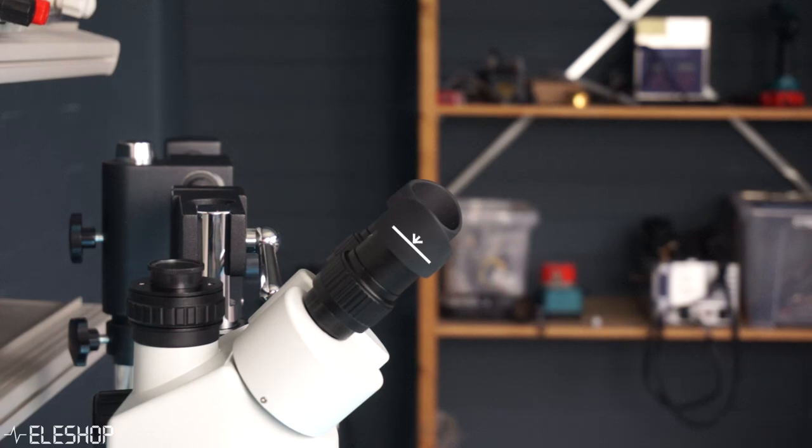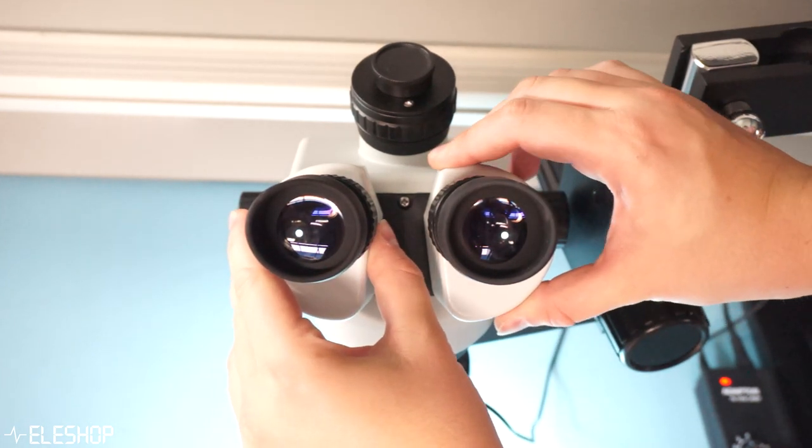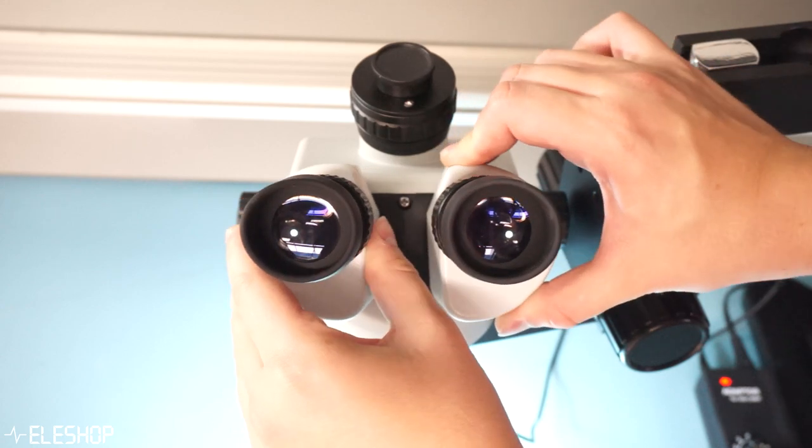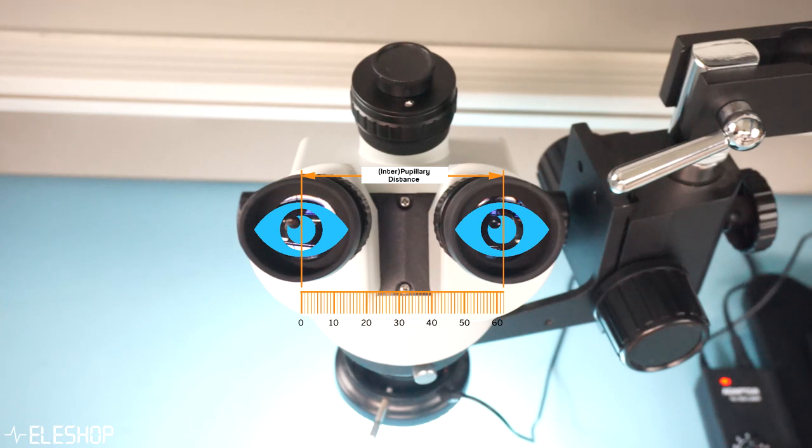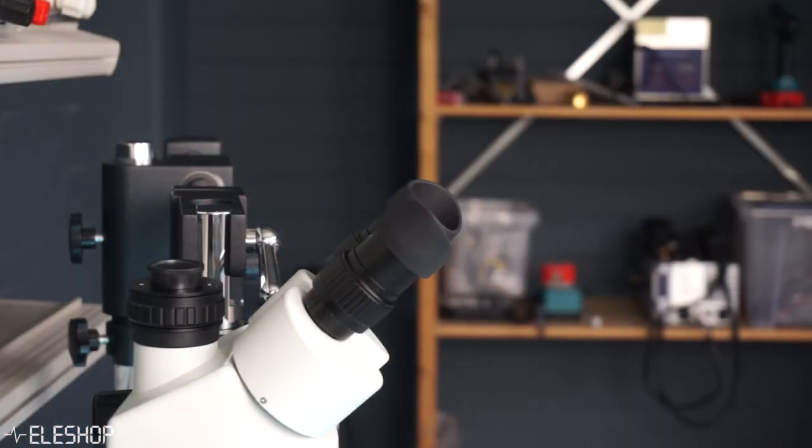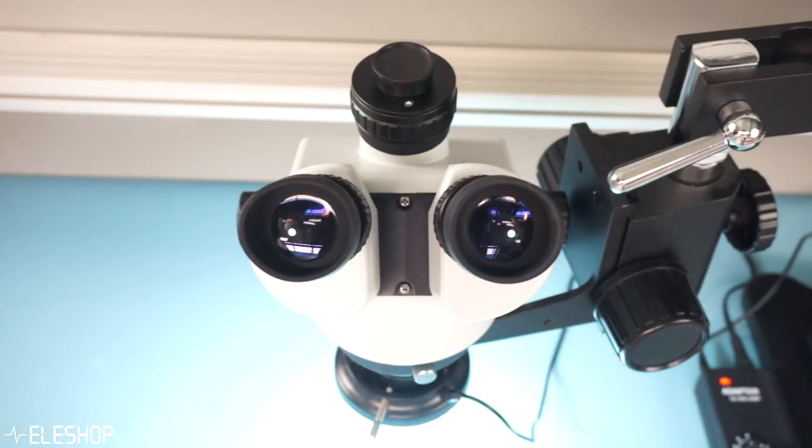Now place your eyes about one centimeter from the eyepieces and bring the eyepieces closer to or further away from each other until you see a single image with no black spots. The distance between the center of the eyepieces should match with the distance between the center of your pupils. Do not lean into the eyepieces because you won't see a good single image without black spots and you will probably smudge your lenses. So it is important to stay distant with your eyes from the eyepieces.